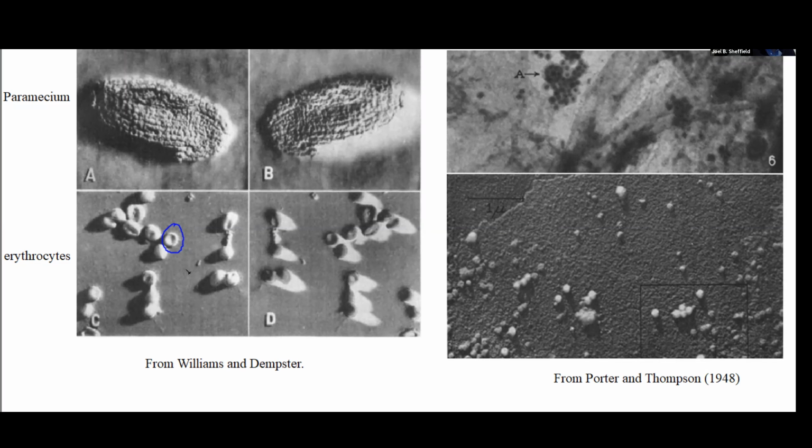And the background, which does have some coating, has some grayness to it. And the area that was close to the electrode, so I'm assuming the electrode was actually up here somewhere, and the direction of the flow of material is like that, okay? So it builds up on one side of these erythrocytes, just as I drew it. And then on the other side, there's much, much less.